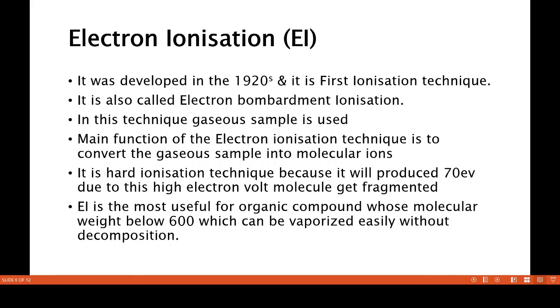This electron ionization is most useful for organic compounds whose molecular weight is below 600, which can be vaporized easily without decomposition. Several other compounds, thermally stable or volatile compounds in solid, liquid, gas phases can be detected with the use of this technique. Okay, this is about the electron ionization.